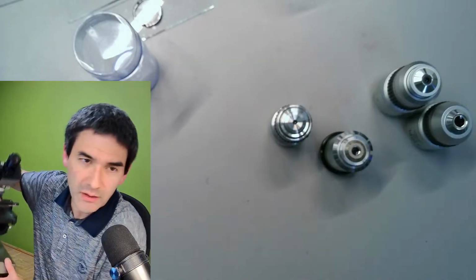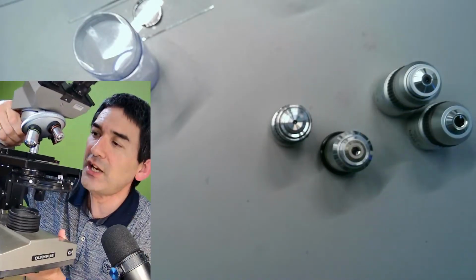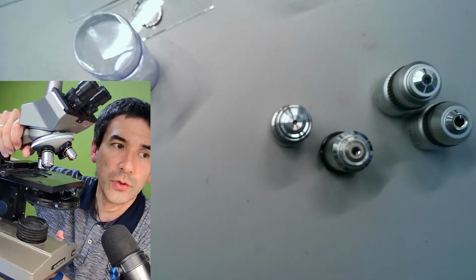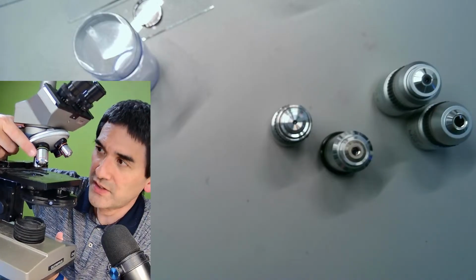It's a little bit heavier. Okay, I'm going to show this to you. It's a so-called Olympus CHA microscope from the 1970s, 1980s. I basically converted it also to phase contrast. You see over here, these are the short barrel objectives as well.